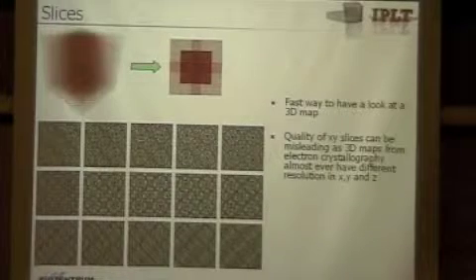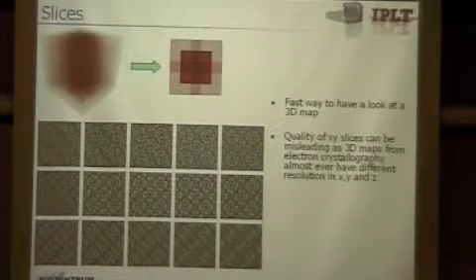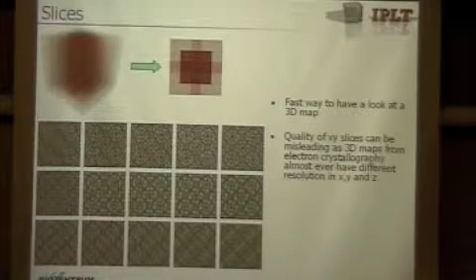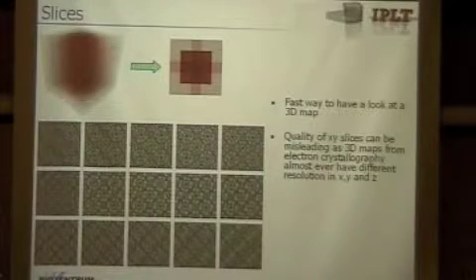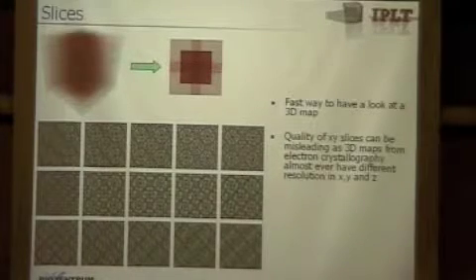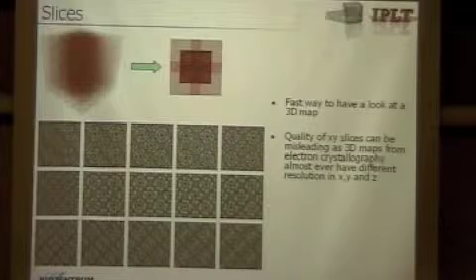You always take only what you see. That's the problem. As soon as you can do a real 3D visualization, there you see it. So, yeah.